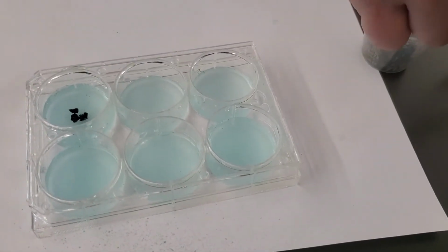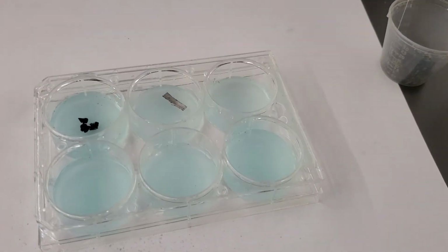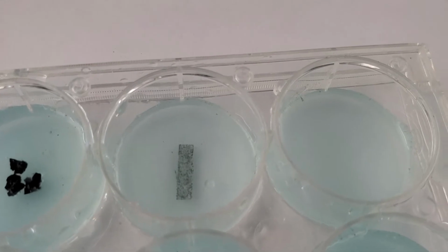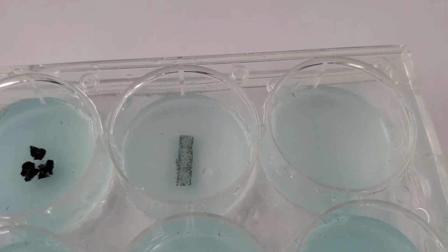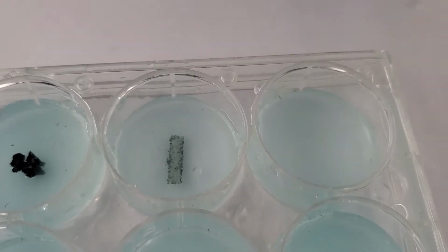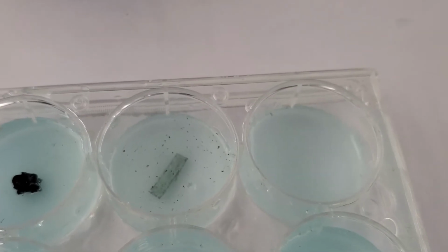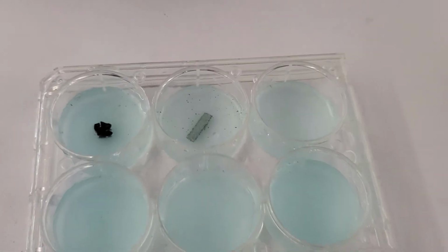Next, we're going to add magnesium. This one will sink. I'm just going to make it sink a little bit. And you're going to see something happening to the surface of it. You should see it turning darker, and when I swirl it around, you can see the dark pieces stay behind. So something's happening in that one.